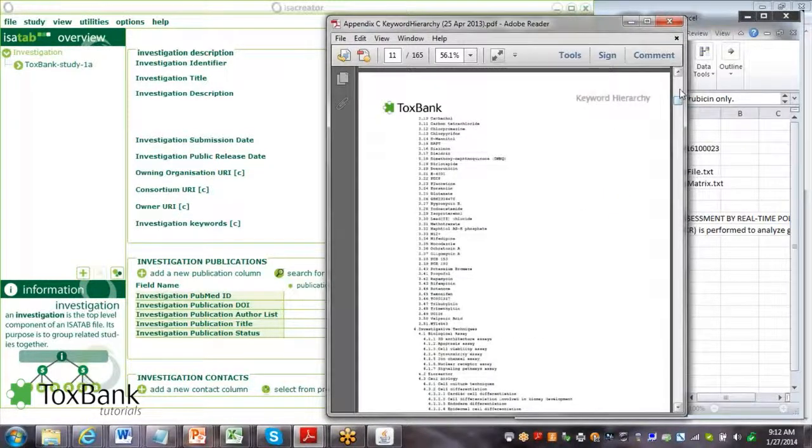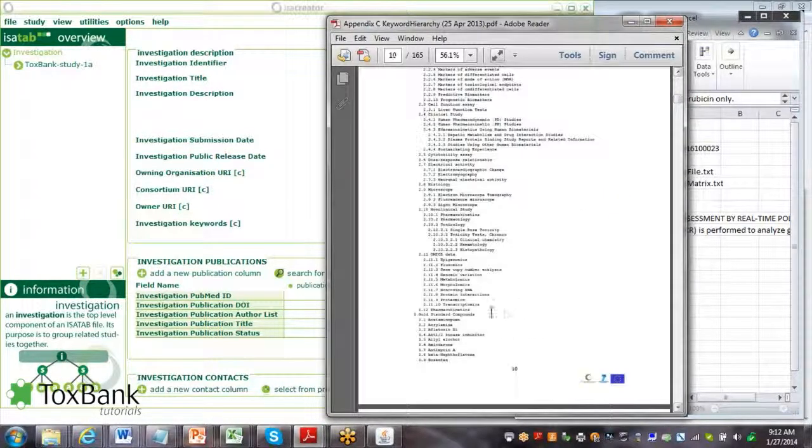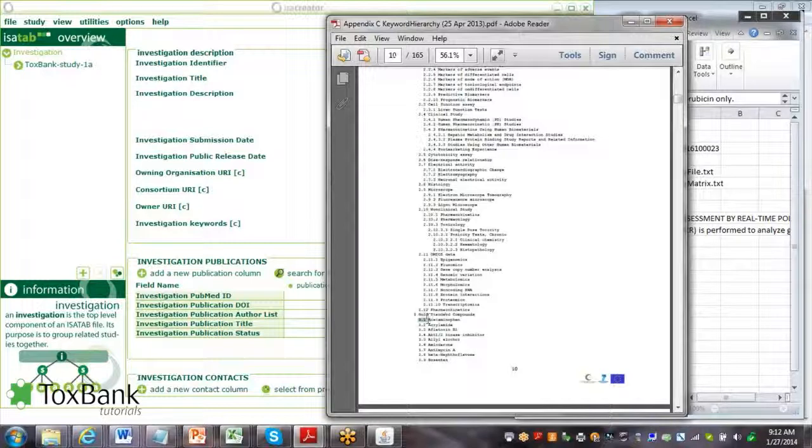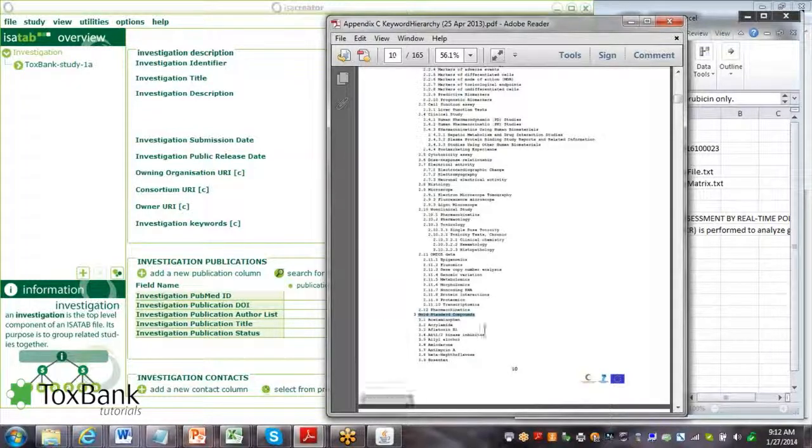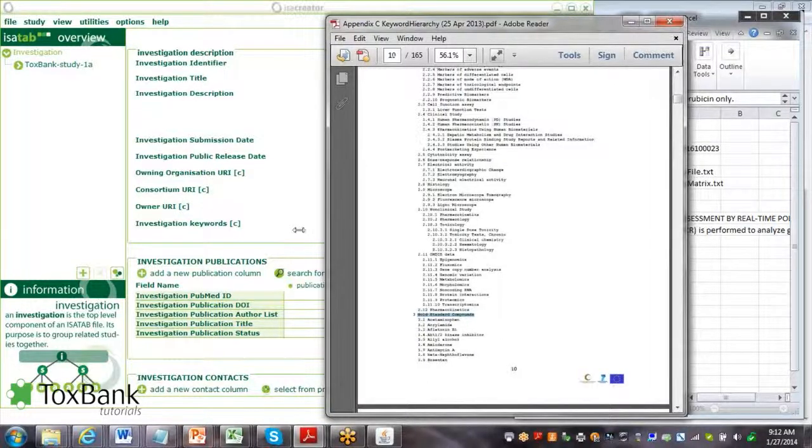The next section is chemicals that were tested. Here is a listing of the gold standard compounds that were used throughout the Surak project.